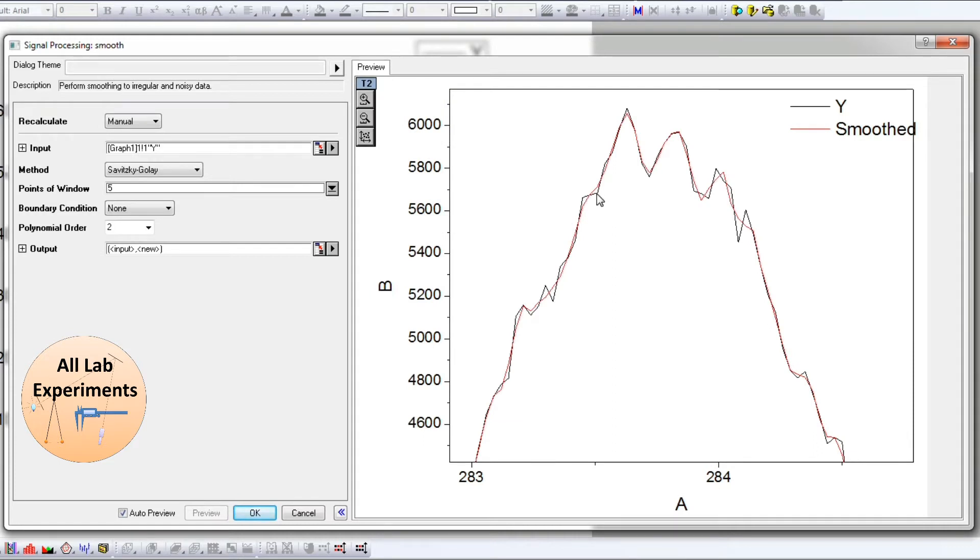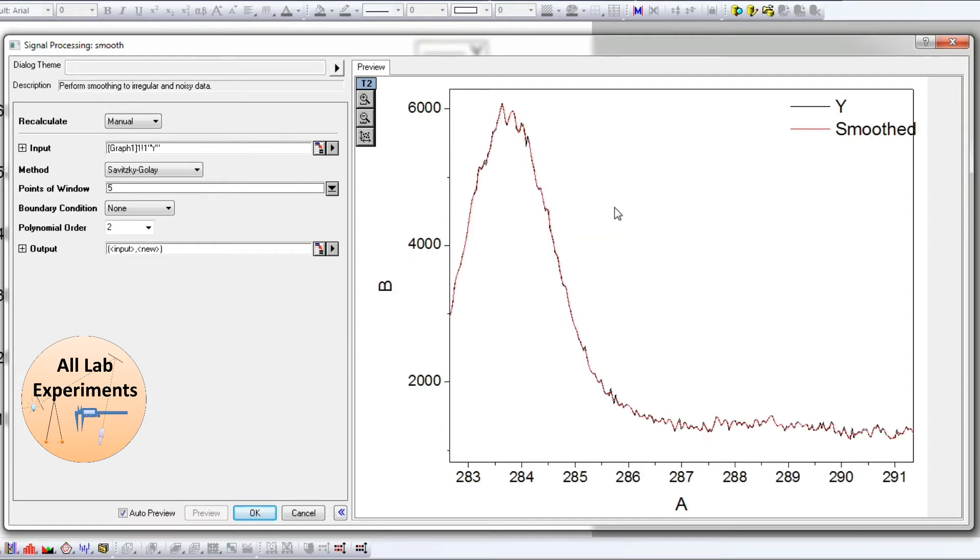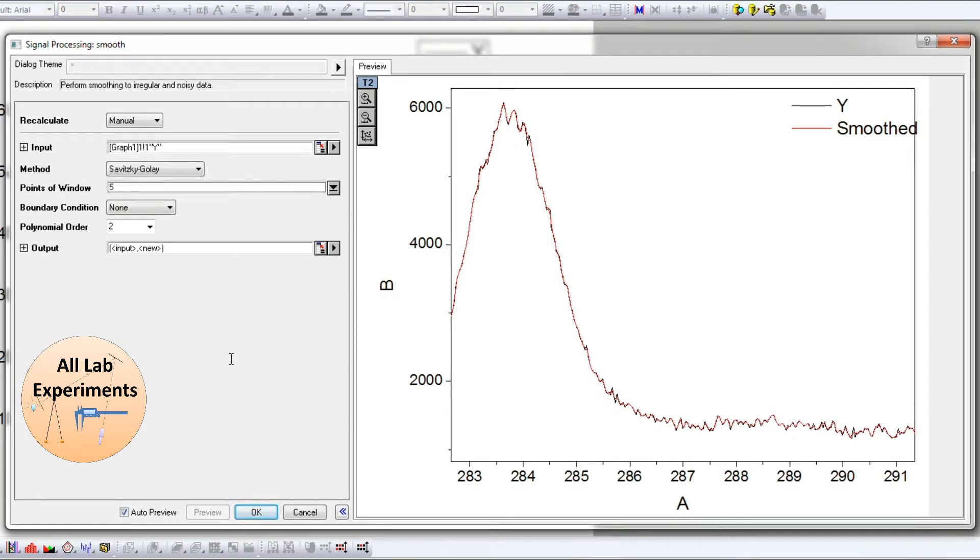Look at it closely. Here is one black line and one red line. The black line is the original data and the red line is the smooth data. You can consider two parts: one is this peak and another part is this section.